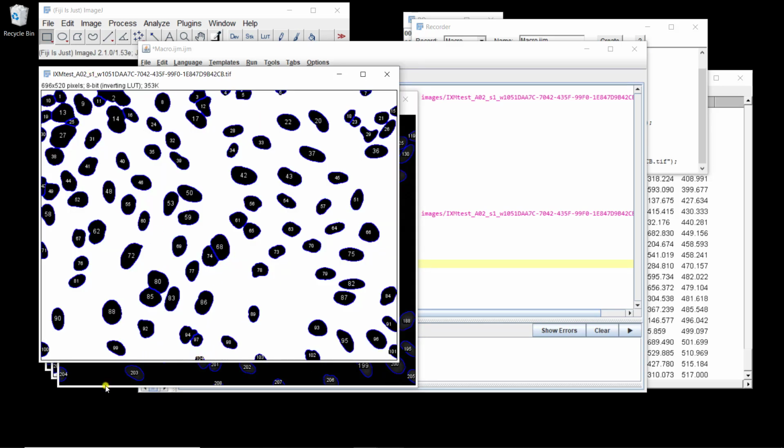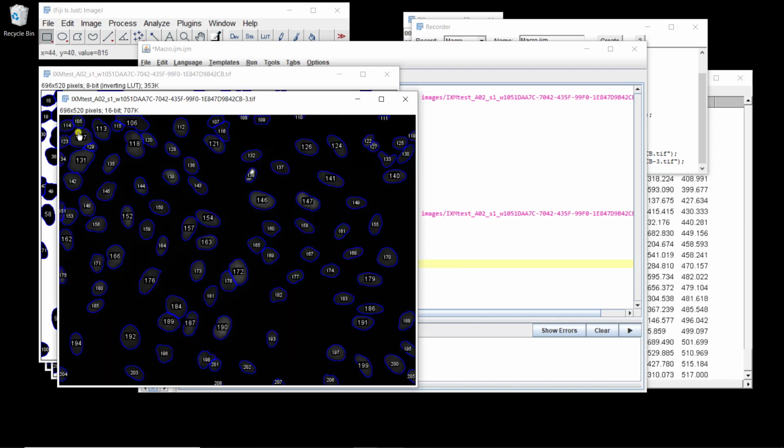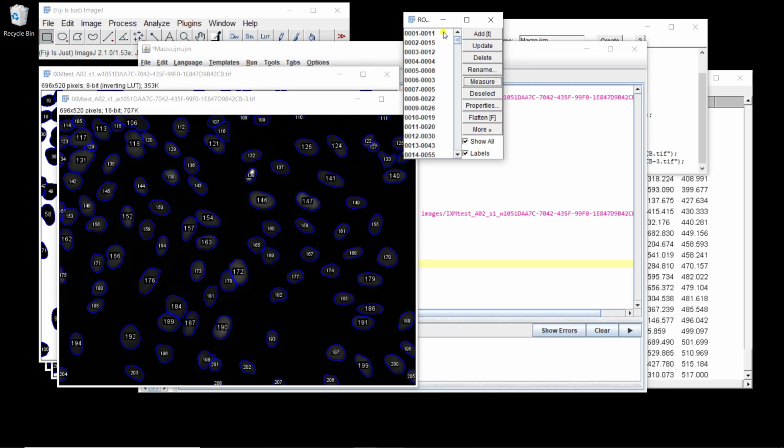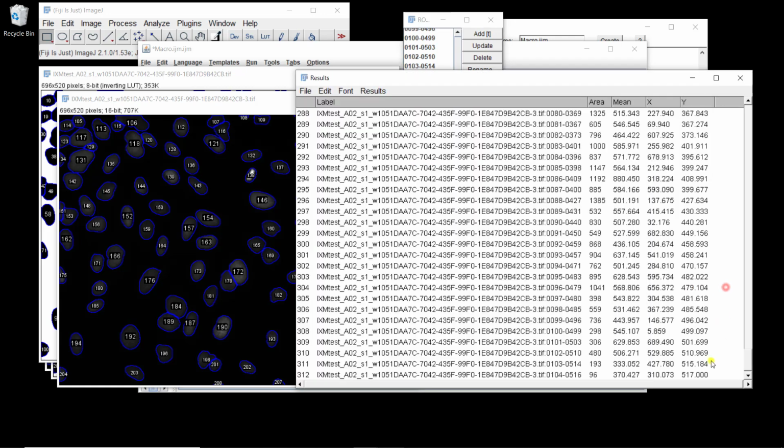So in the first analysis, and then we started at 105, it's because we added new rows. So this is the first 104 rows, and then we added the new 104 rows because we didn't clear the row manager, and that has a direct consequence here.